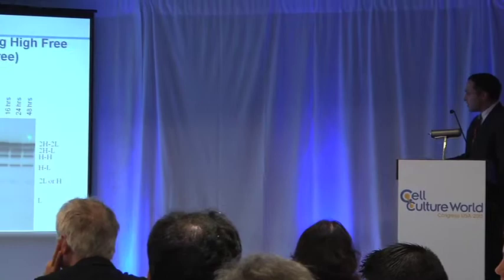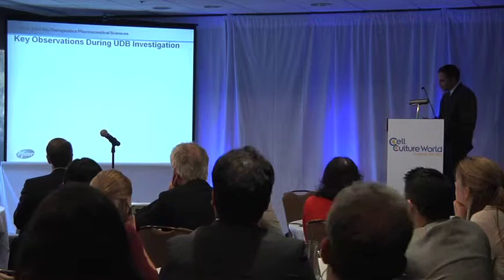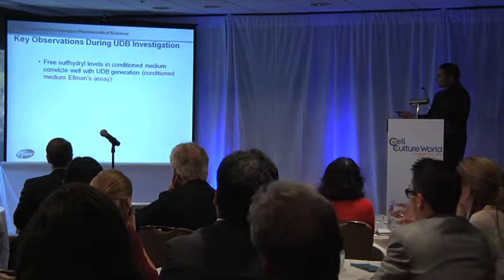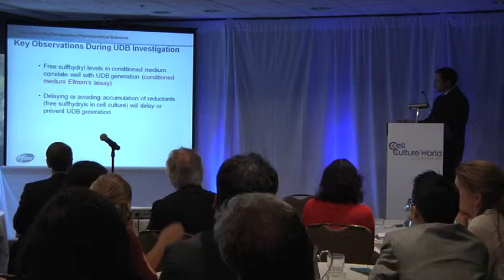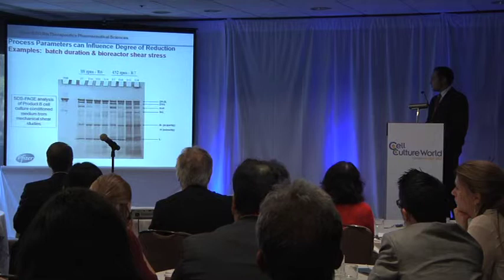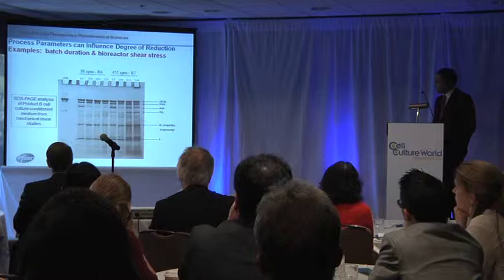We implemented some development campaigns. With this particular product — product A — what we saw was that the antibody was reduced using high-free-sulfhydryl-containing conditioned media. You can see a control sample and then incubating it in conditioned media containing high free sulfhydryls, showing a reduction in antibody. The intact antibody is the top band, with partial species in the other lanes once incubated. This gave us an understanding of what was going on with UDB — specifically, free sulfhydryl levels in the conditioned media correlated well with UDB. We observed that delaying the accumulation of these reductants led to lower or prevented UDB.